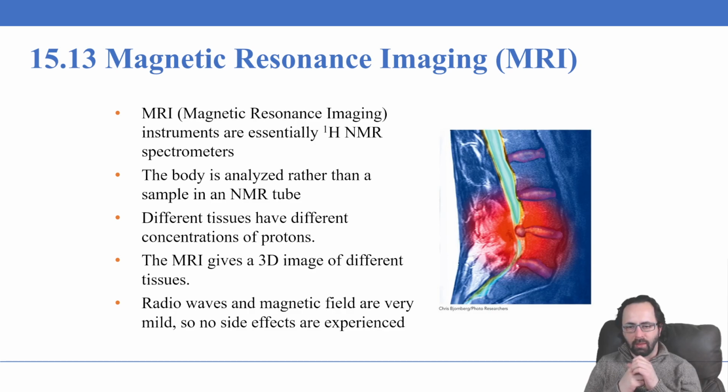So at this point, we've completed our lectures for this week. We've seen the powerful technique of nuclear magnetic resonance for determining the structures of molecules. Particularly useful is the proton NMR, in which we analyze the chemical shift, the splitting pattern, and the integration of the peaks to figure out how many protons they represent, where in the structure those protons lie, and what the neighboring carbons are that we can determine via the coupling and splitting patterns.